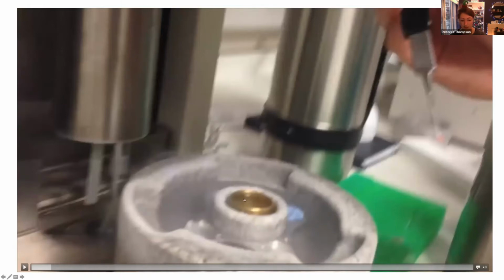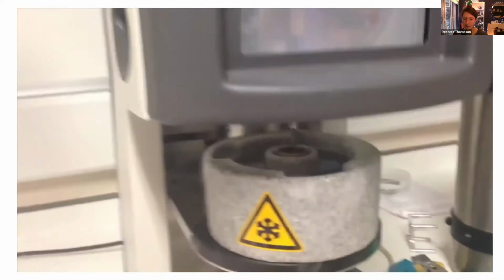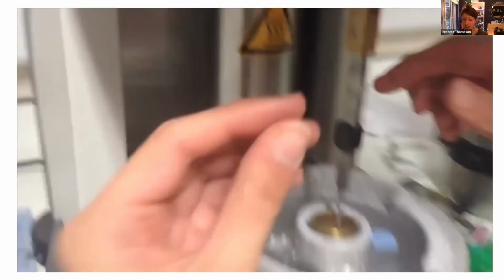What we have is a bucket, which is filled with liquid nitrogen, and inside here we have a cryogen cup, which is filled with liquid ethane. And what we're going to do is take our electron microscopy grid, which is on these tweezers here, and then that is going to get raised up into this chamber, which is humidity and temperature controlled. And then through one of the ports in the sides, we just use a pipette to apply small volume, typically 3 microliters of liquid, onto our electron microscopy grid. And then we use filter paper to blot most of that liquid away, forming a thin film, and the grid is then frozen by plunging into liquid ethane.